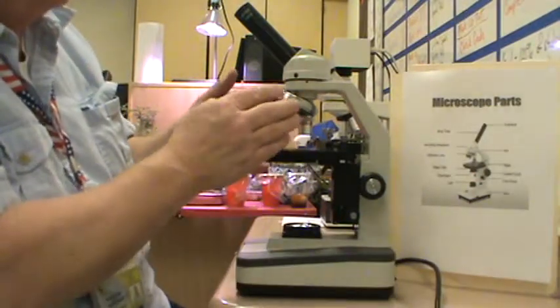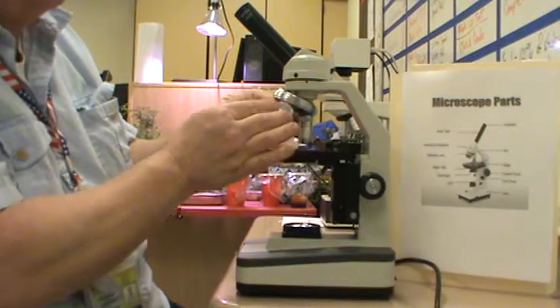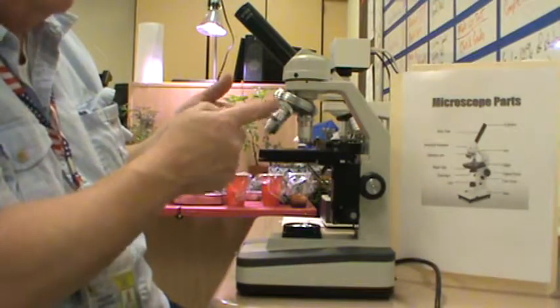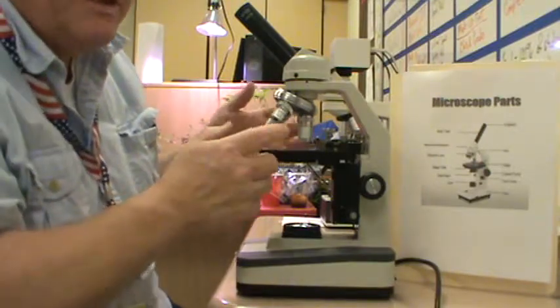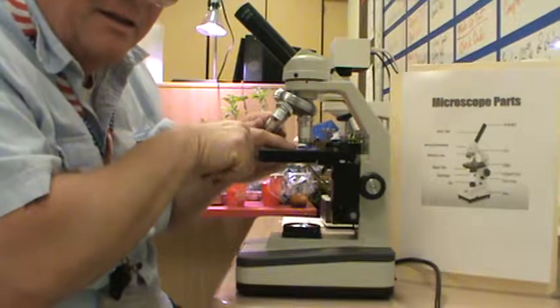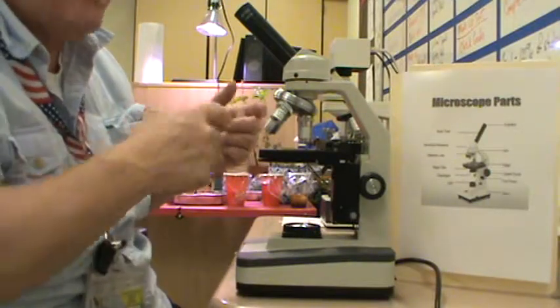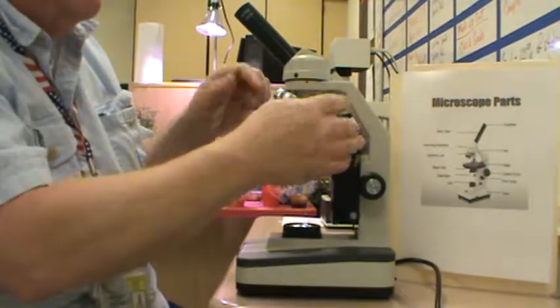We have the revolving nose piece. This has room for 3 objective lenses. That's what these lenses are called. The object of these objective lenses is to see the object that's in your slide. See what I did there? Okay.